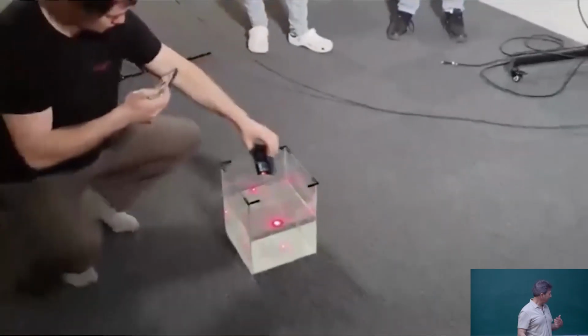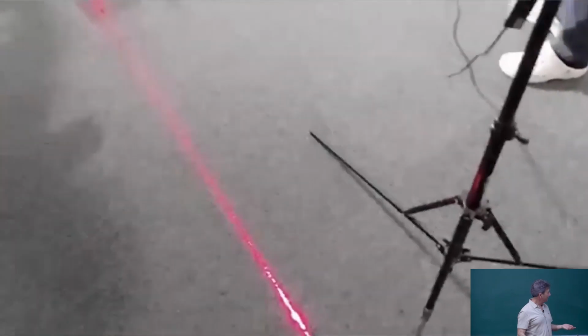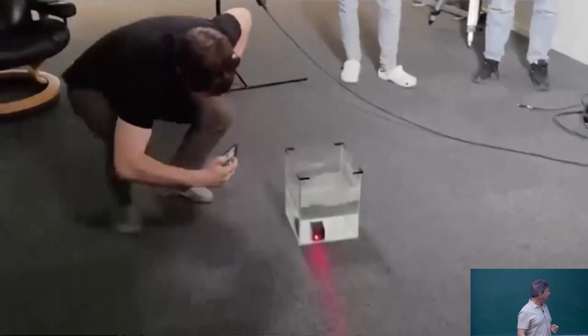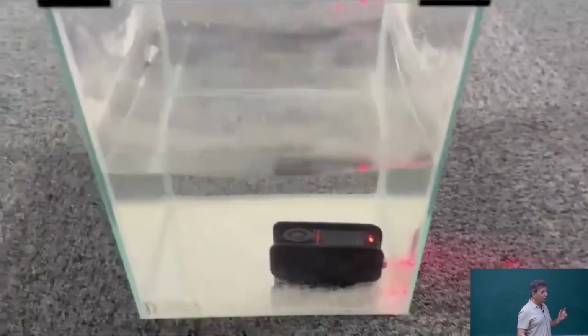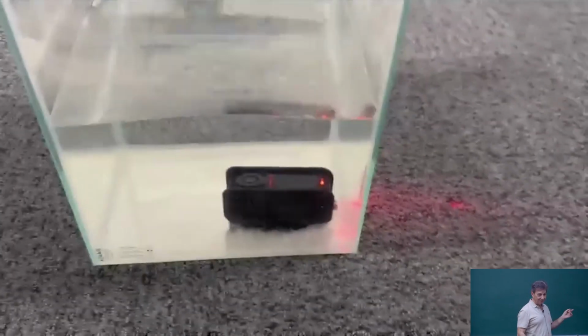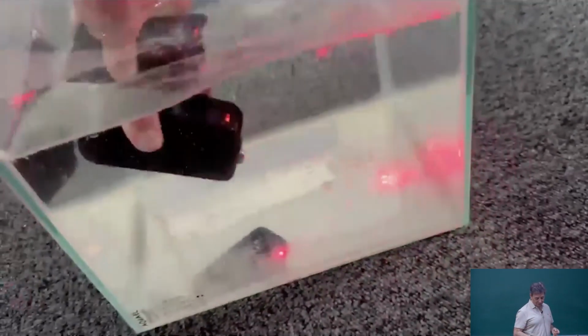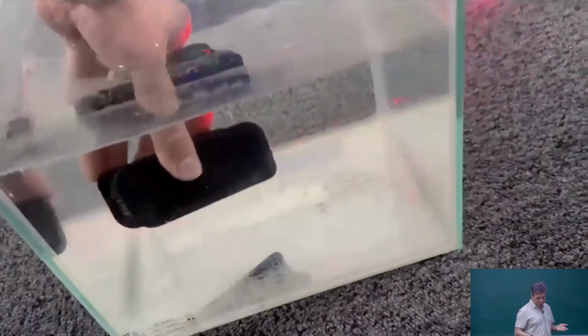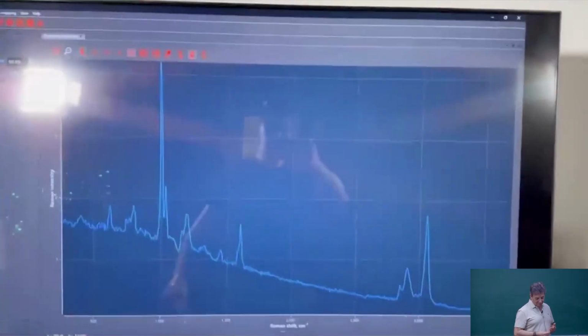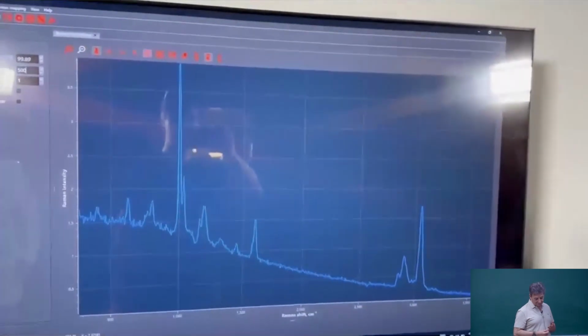It's running. So they put it into the water. It's still running. This is a near-infrared laser. You don't see near-infrared light, but the CCDs do see near-infrared light. The people there don't see that light, but the telephone will see that light. That's why they also have the glasses to protect their eyes. So the system is working fine, and it keeps on running without a problem. And they also have a certification for impact and these kinds of things.